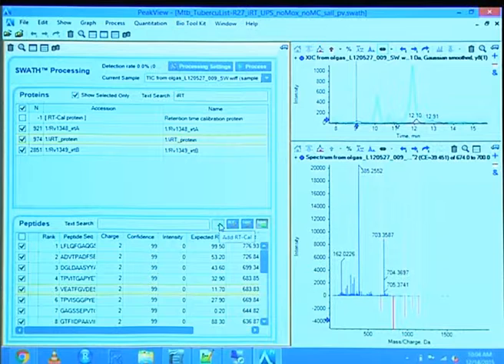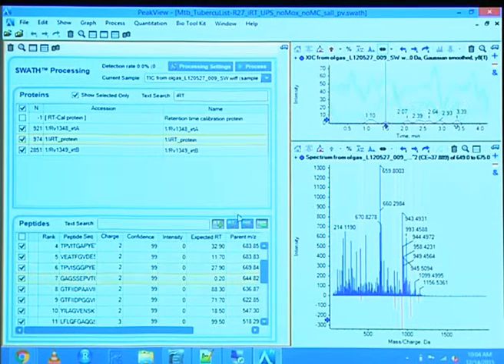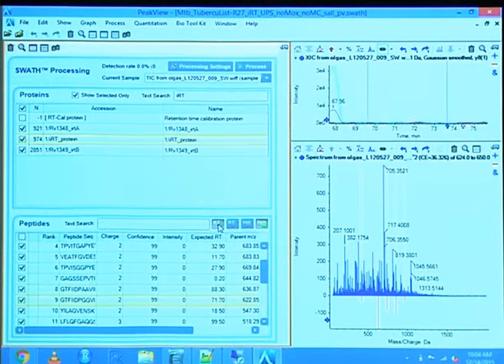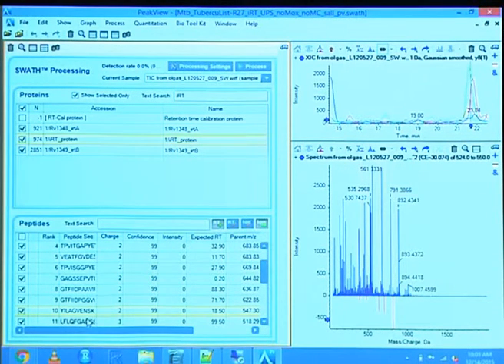You can also see in the trace field up here that there are no peptides there. This is not how good data looks, so that can already give you an impression of what a wrong result might look like, simply because it looks at the wrong place. Come on, just one more.